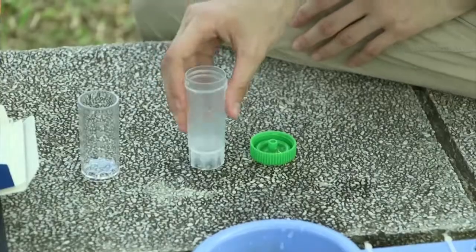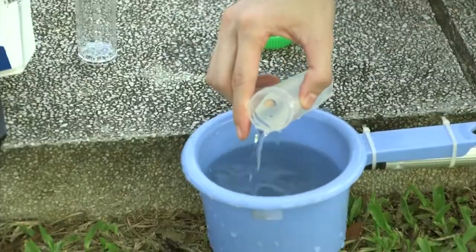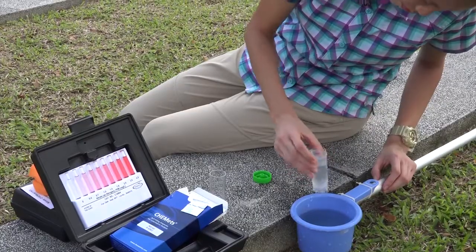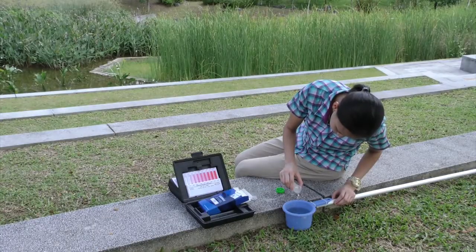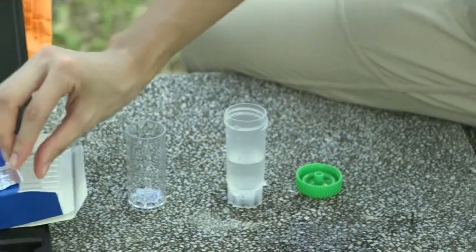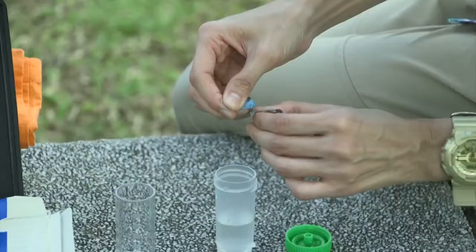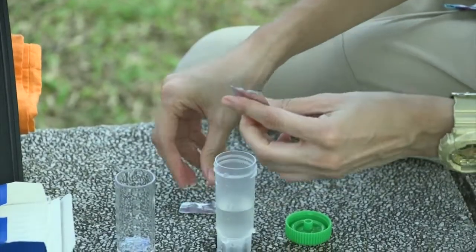Fill the reaction tube up to the 15 milliliter mark with the sample to be tested. Then, empty the contents of 1 cadmium foil pack into the reaction tube. Take care when handling this pack.